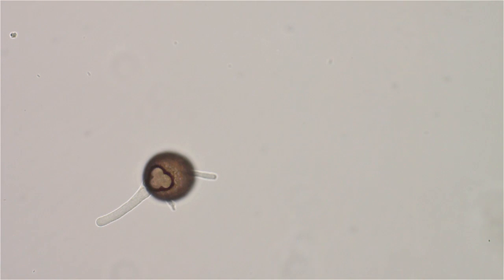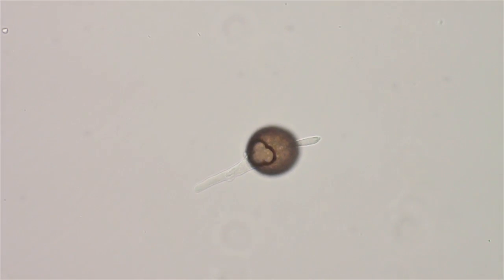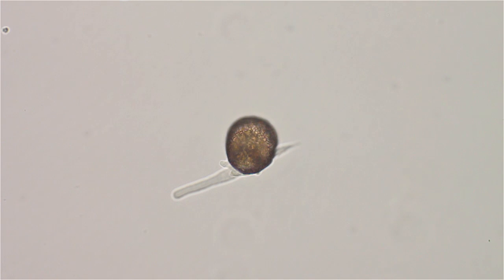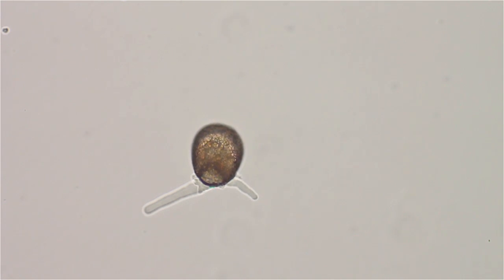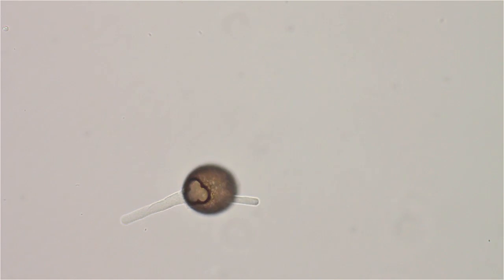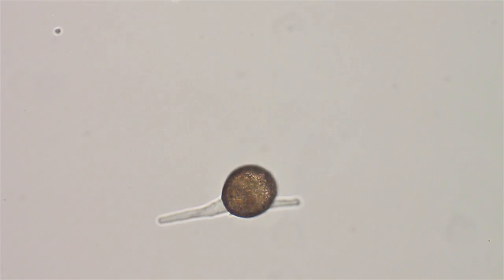I wish he'd turn on his side and give us a better view, but we can't ask him. Now he's just motoring along like a snail. Well, possibly we're just looking right down through it and that is the bottom opening — that's what it looks like.